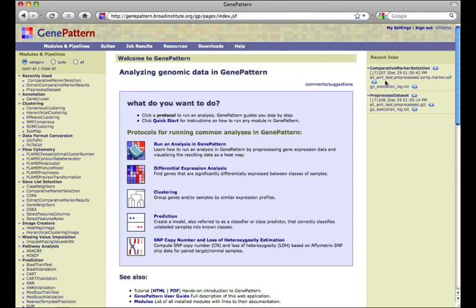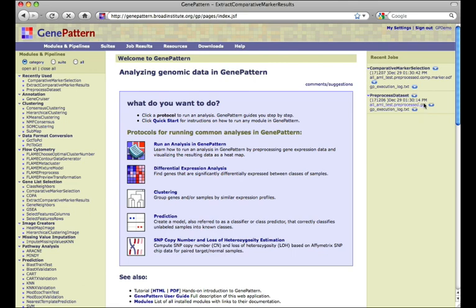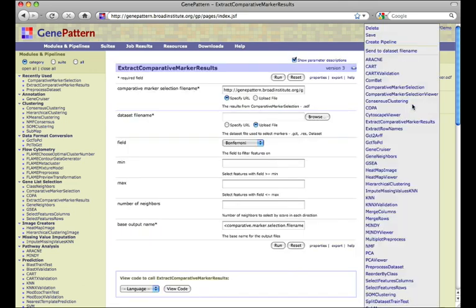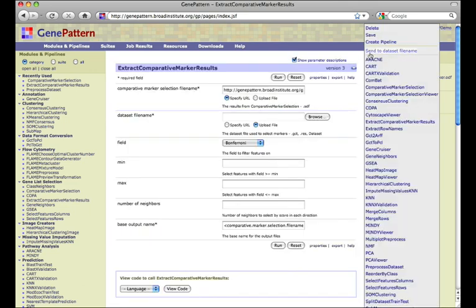So we pass the output of comparative marker selection to extract comparative marker results and set the parameters to our liking.